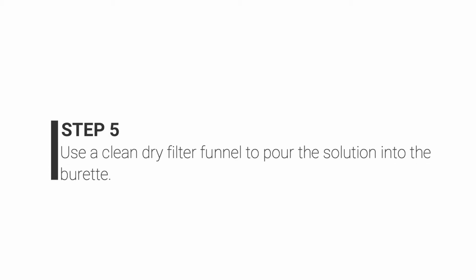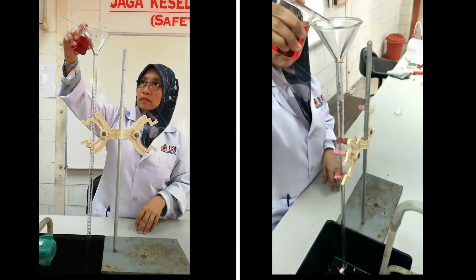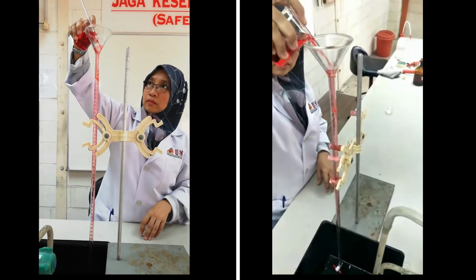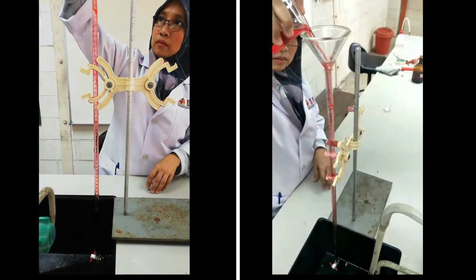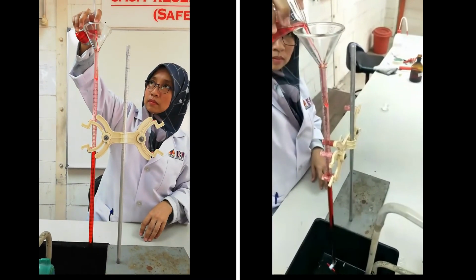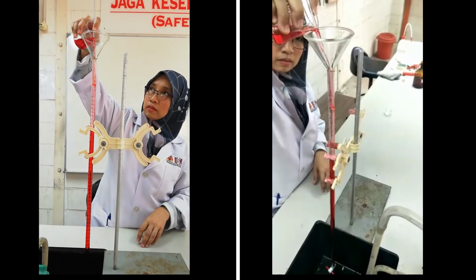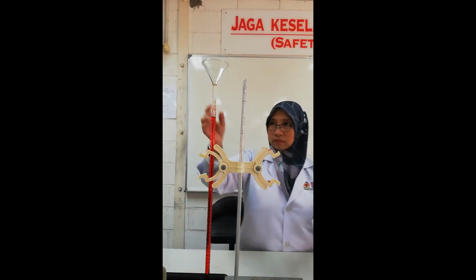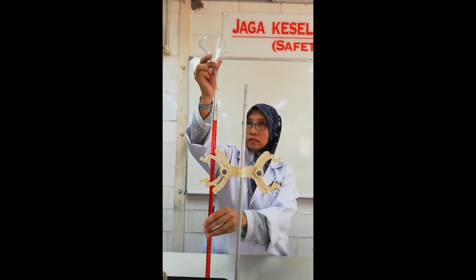Close the stopcock by turning the stopcock fully perpendicular to the burette. Now, fill the burette with the solution. Pour the solution in from the top using the filter funnel. Fill the burette to the top above the zero graduation mark. Be careful not to overfill the burette. Once the burette has been filled, remove the filter funnel from the burette.